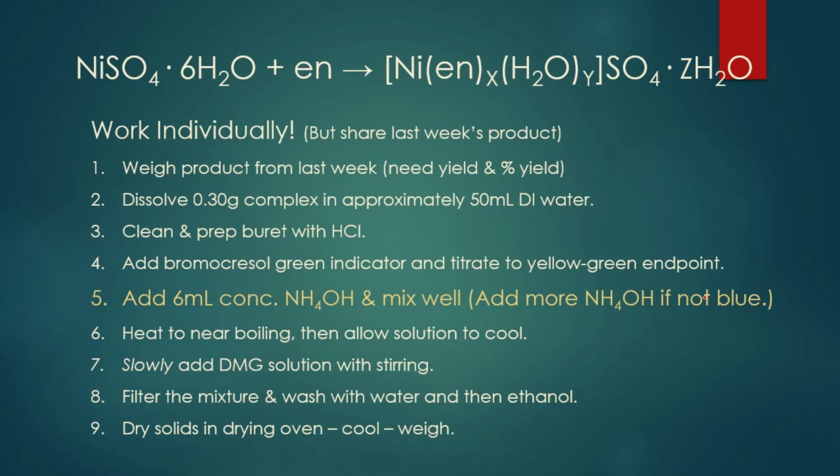You shouldn't have to add more, but you're going to add this. The ammonium hydroxide is a very pungent material. We keep it in the hoods. We don't carry it around to our room, which is one of the reasons I didn't bring it in here. That and the fact that we're going to have to heat this stuff. But add it in the hood, and then once it's diluted, you can take it back to your workspace.